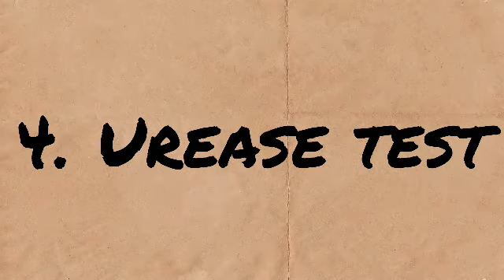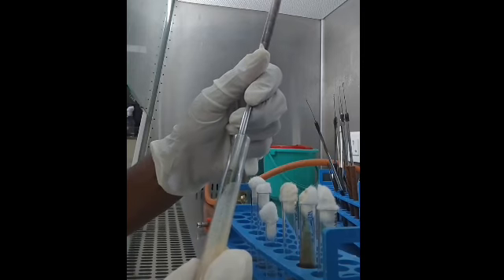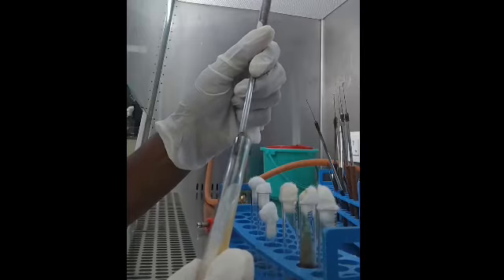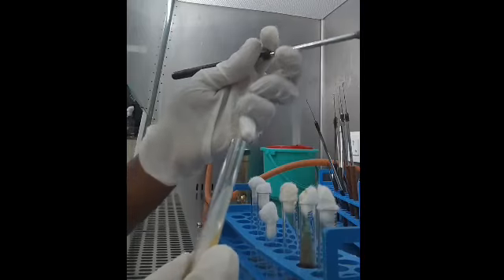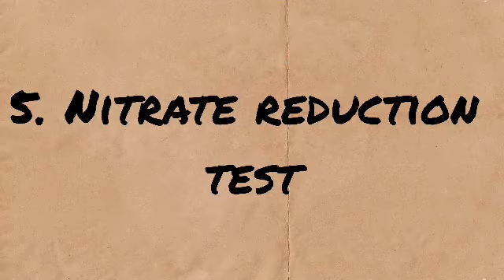Next comes the urease test. This test detects the urease enzyme. This is performed by inoculating the bacterial suspension by streaking the slant. Then the tubes are incubated for 24 hours.